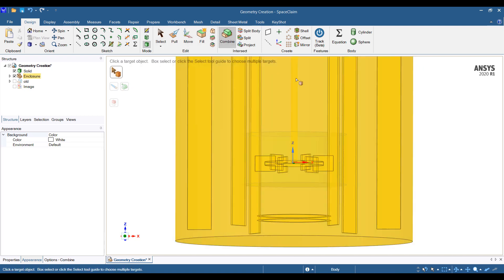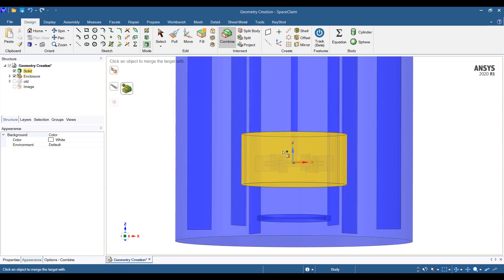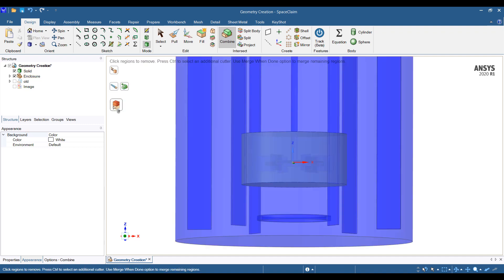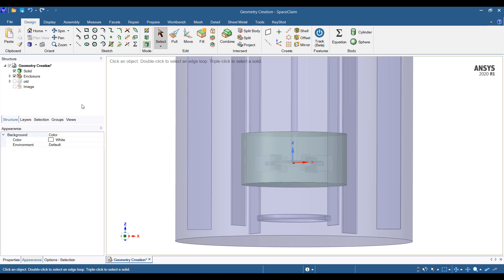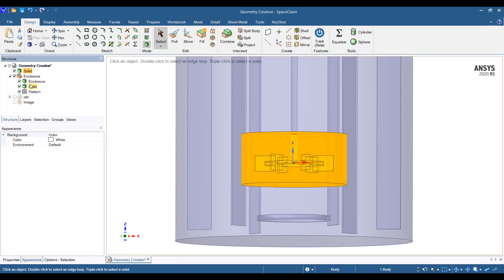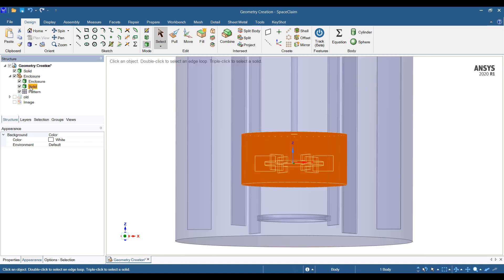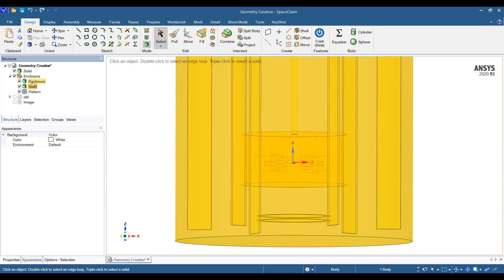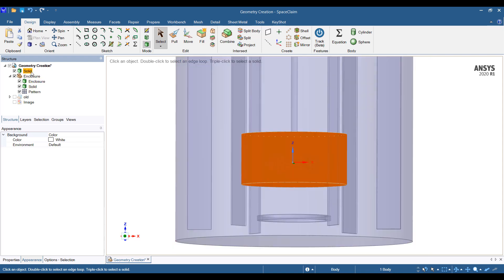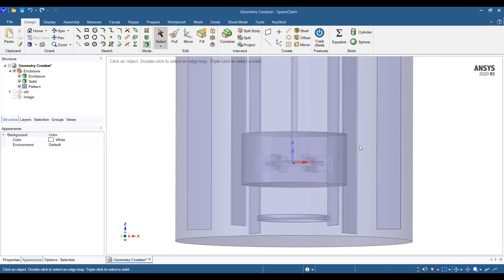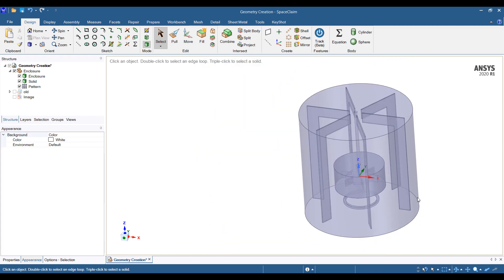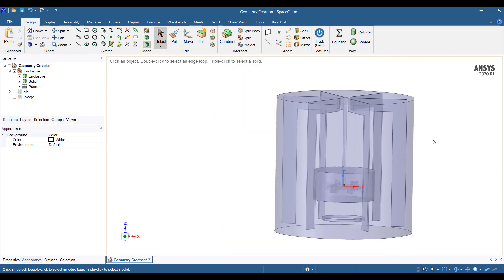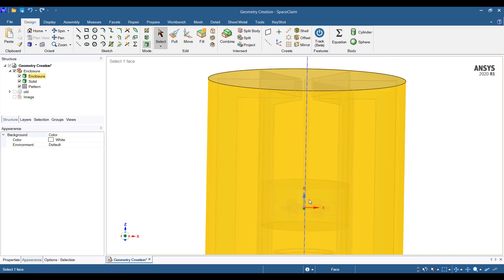To do that we're going to use the combine. We're going to cut this part out. And that's it. So now our enclosure is in two parts. There's the fluid, the rotational domain, as well as the stationary domain. Delete the turbine. This is we can go ahead and run the simulation now. This area will spin. The top will we can have sparging from the holes specified there. But this could be a big model.